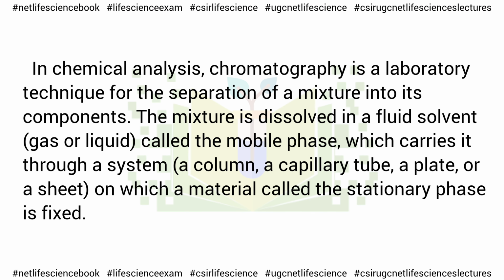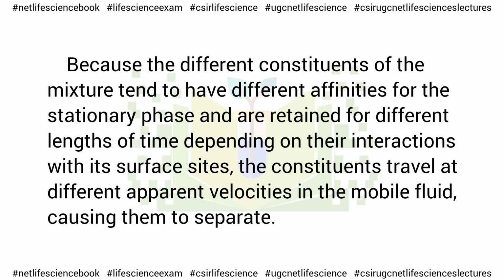Chromatography. In chemical analysis, chromatography is a laboratory technique for the separation of a mixture into its components. The mixture is dissolved in a fluid solvent called the mobile phase, which carries it through a system on which a material called the stationary phase is fixed. Because the different constituents of the mixture tend to have different affinities for the stationary phase and are retained for different lengths of time depending on their interactions with its surface sites, the constituents travel at different apparent velocities in the mobile fluid, causing them to separate.